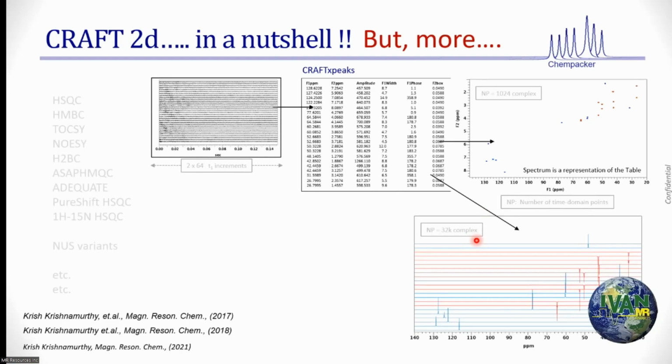Nothing else was done, no experiment done. All I did was analyze it differently. Not do FT. I don't want to say not do FT because this is FT. I did an FT to get to this picture. Not rely upon the frequency domain data to extract that information. Rely straight on the time domain data.